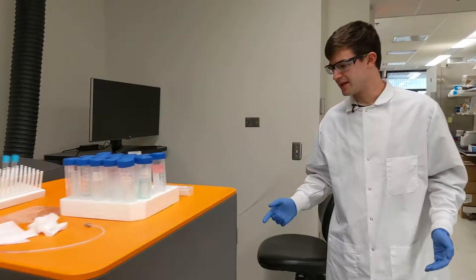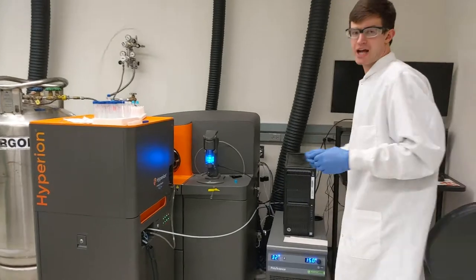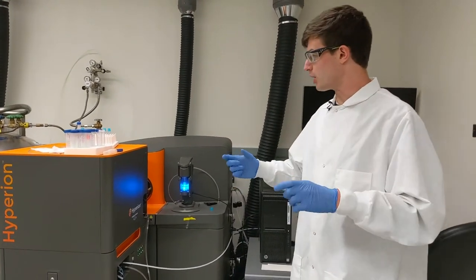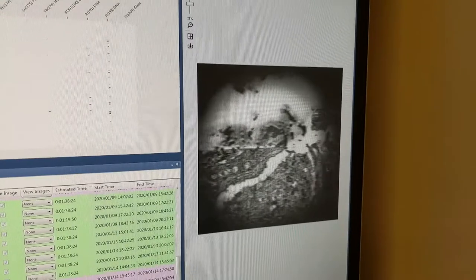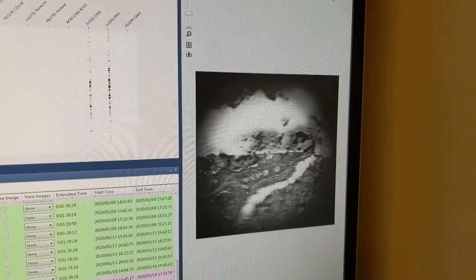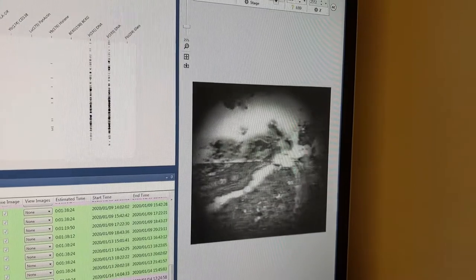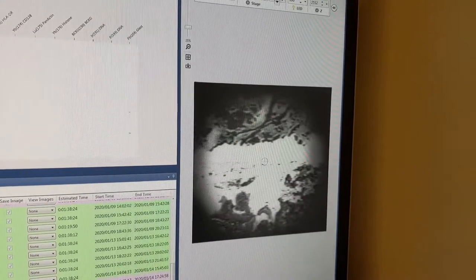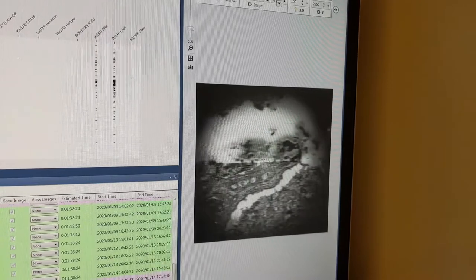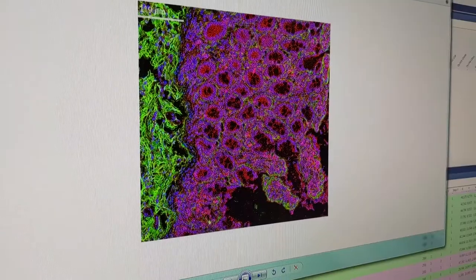This one's a little bit different. Instead of looking at individual cells in suspension one at a time, we can actually look at tissue. So you get spatial information as well. In imaging mass cytometry, instead of ionizing each cell individually, we shoot a tissue sample with a laser and ionize a square micron of tissue at a time. We can then look at the metals present in each square micron, and this tells us what proteins are in the tissue and where, so we can put together what cells are present, where they are, and get information as to which cells are next to each other and how they might be interacting.